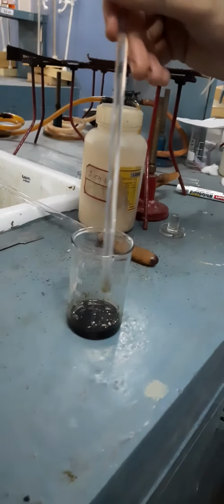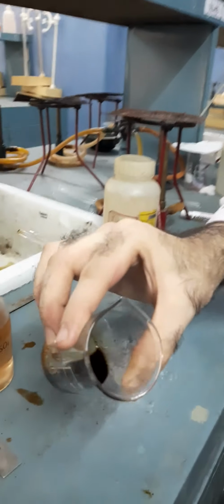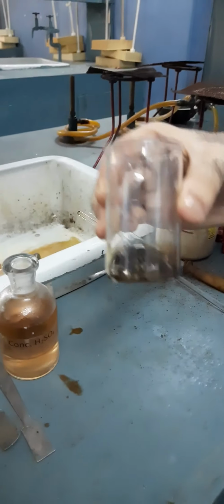Okay, so there it goes. You can see it has turned black. You can check it out. The color has changed. It is black in color.